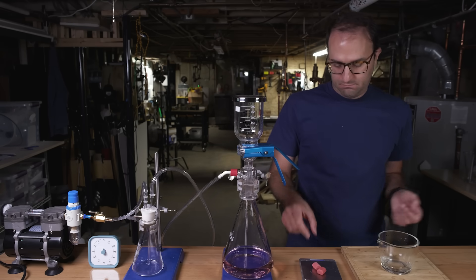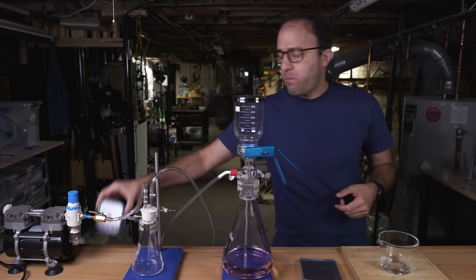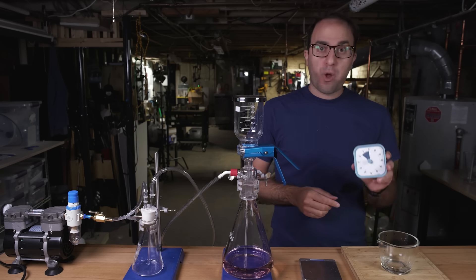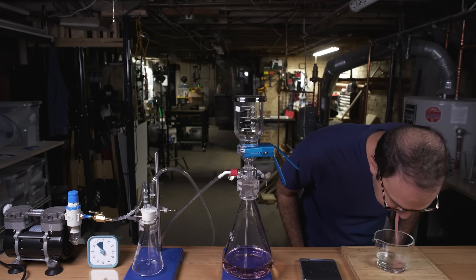You don't normally chew the science, but in this case gum is made to be chewed. Chewing gum is what happens out in the real world, so if you're trying to model something that happens in the real world in your lab — or in this case, my basement — you want to try and be as accurate as possible.